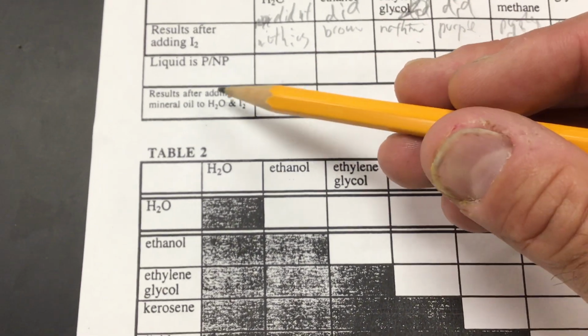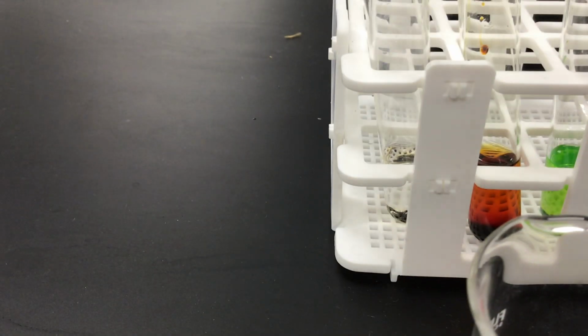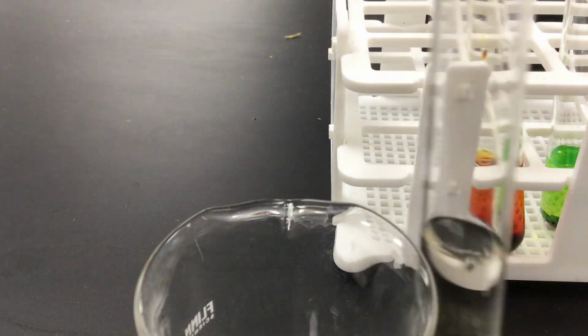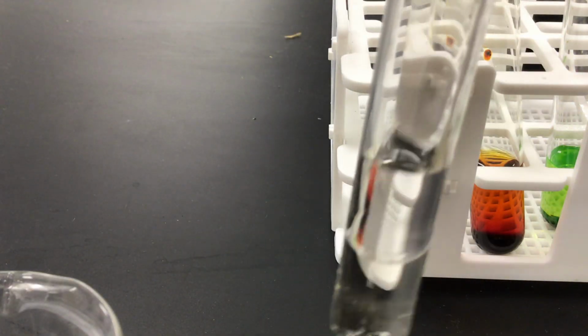Now what happens after you add mineral oil to the water and the iodine? So you end up with 2 layers. Now we're going to mix it.